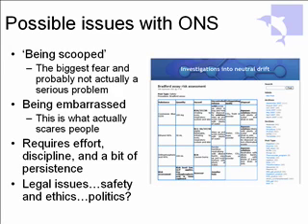I was talking to someone at Oak Ridge yesterday where they actually do have to do that. Every paper, every poster, every note has to be approved by their technology transfer office, which is a nightmare. One area where I am a little bit more worried is safety information. Now in the UK, it seems to be a little different here. In the UK, safety information is very strongly tied to the lab book.